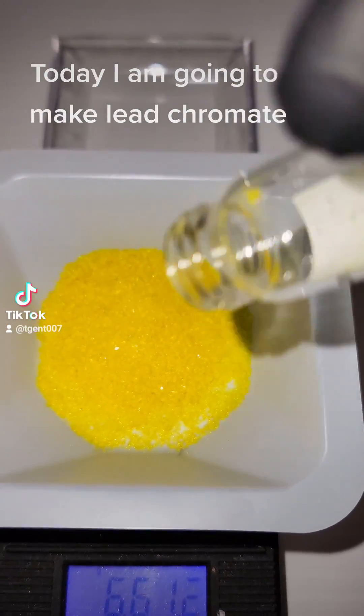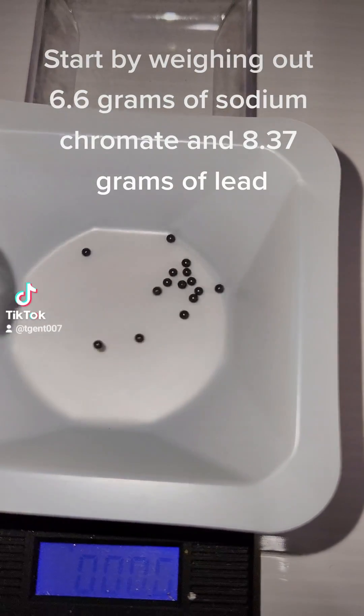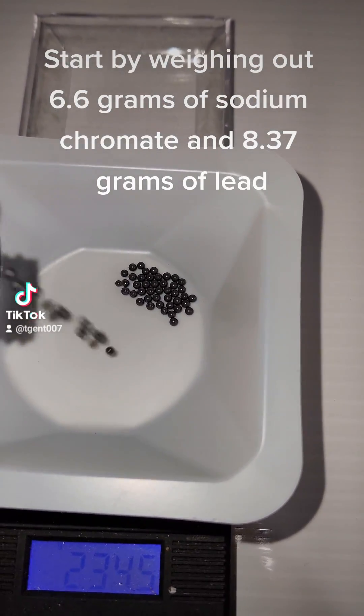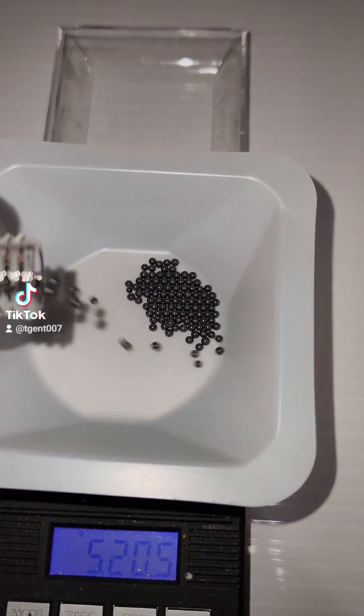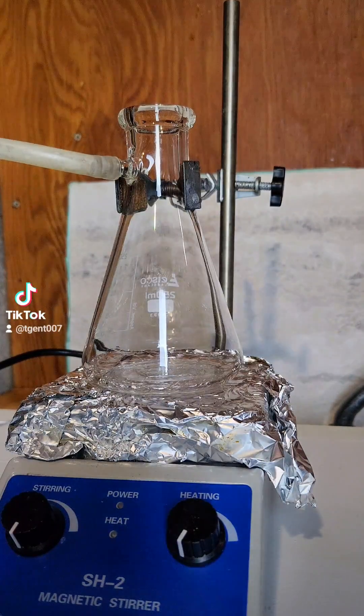Today I'm going to make lead chromate. Start by weighing out 6.6 grams of sodium chromate and 8.37 grams of lead. Maintaining this ratio is important because both of these reactants are highly toxic, but lead chromate itself is relatively non-toxic.